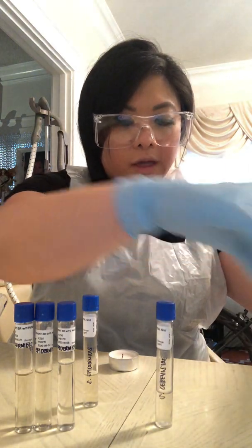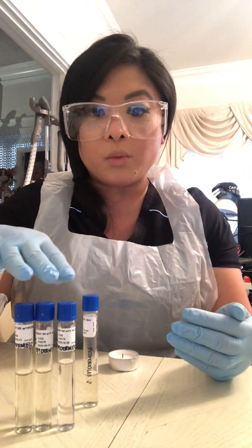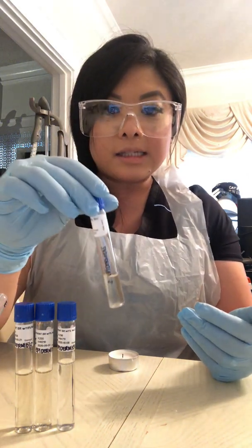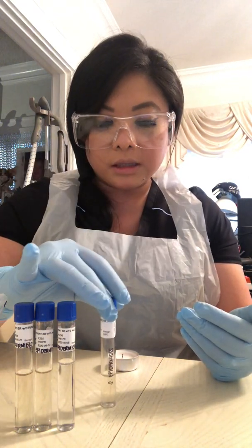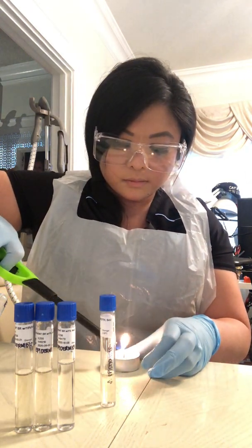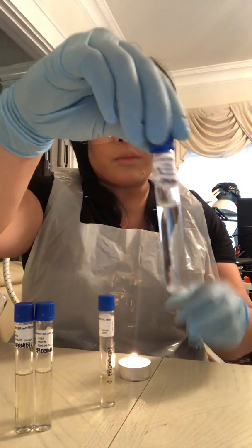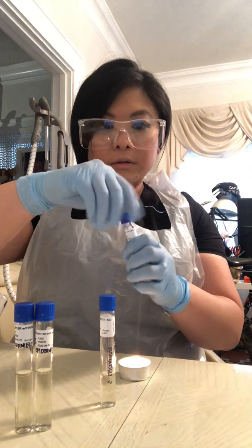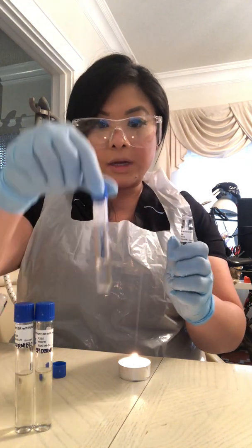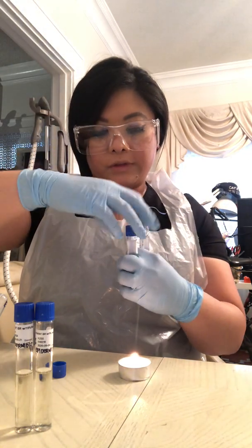So let me go ahead and move that over. And then the second one, I'm going to demonstrate how I did that with my S. epidermidis. So first, I'm going to grab my 1% sodium chloride, and also take my culture vial of S. epidermidis, and I'm going to sterilize both of them.